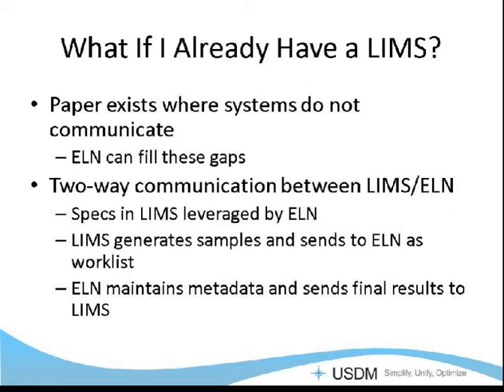So basically, when you're looking through your lab and you want to see where an ELN can help you, the thing that I like to say is wherever there's paper in your lab, it's because your systems don't communicate. So you may have incoming samples into the LIMS. LIMS schedules your samples. You print them out. You know what kind of testing you have to do.